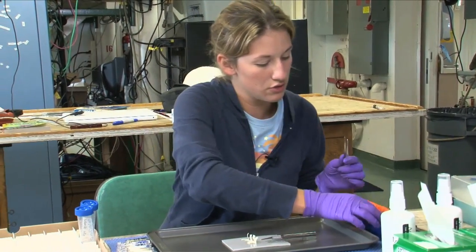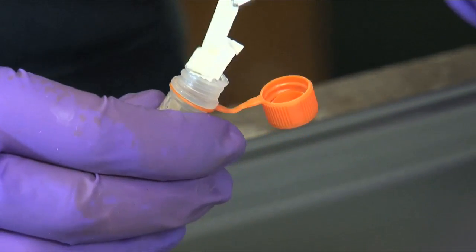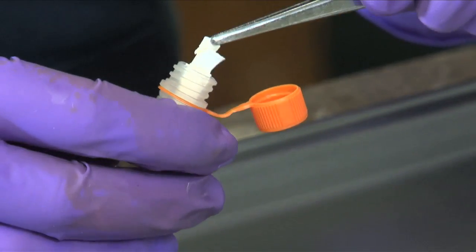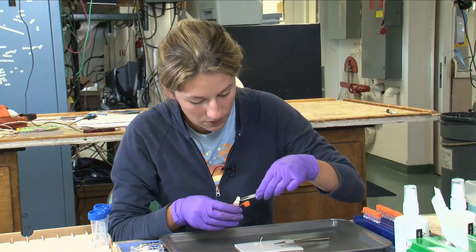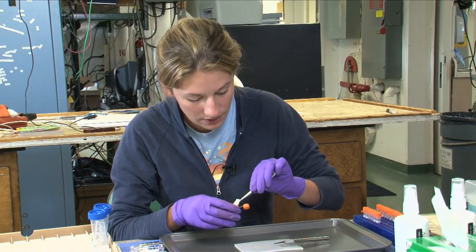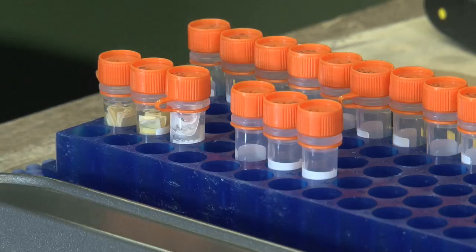Then take your tube and use your tweezers to stick them in there. It can be sort of sticky, so you want to be careful not to get them stuck on your tweezers. Just stick them in the extraction buffer. And then this tube will go in the minus 80 for now, and then we continue with our extraction process when we get back to Maryland.